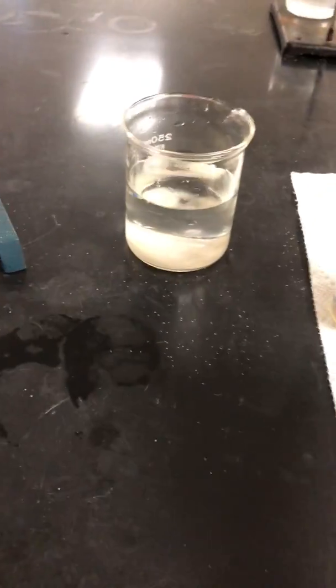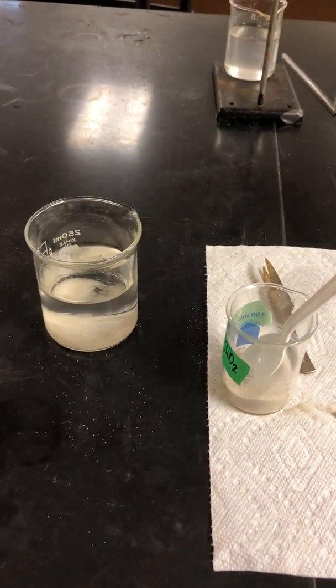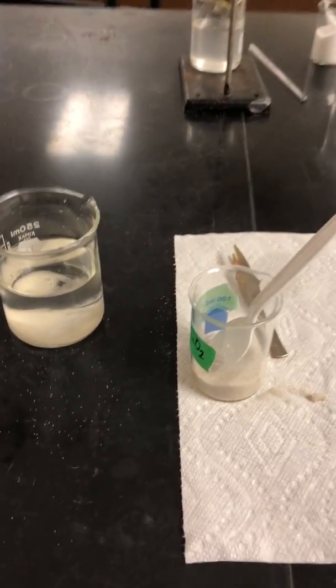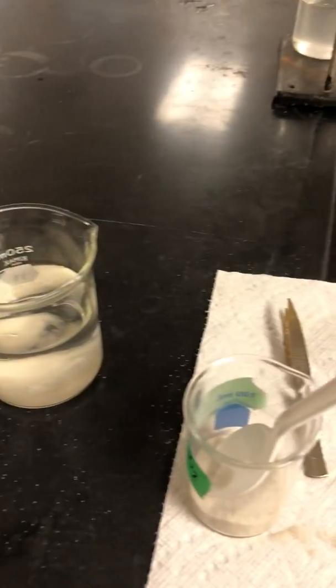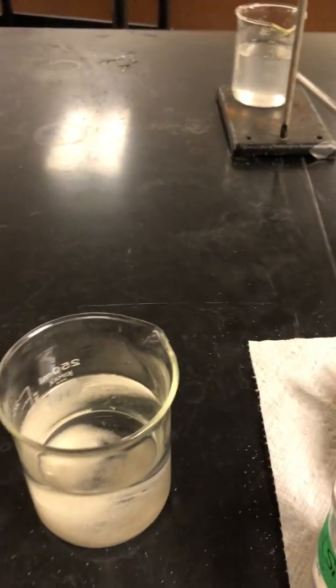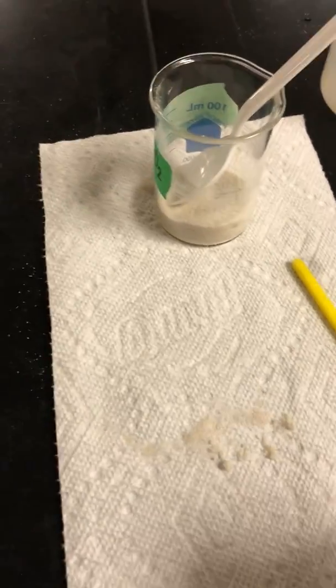We know that the sand is not going to dissolve because, well, we've all seen muddy puddles. We know sand does not dissolve in the water. All right, there you go. Beautiful. Then it says for 30 seconds, remove as much sand as you can with the forceps onto a paper towel. Ooh, look at that, man. Dang, some of my students did a good job. I only noticed that just now. Okay, way to go, guys.